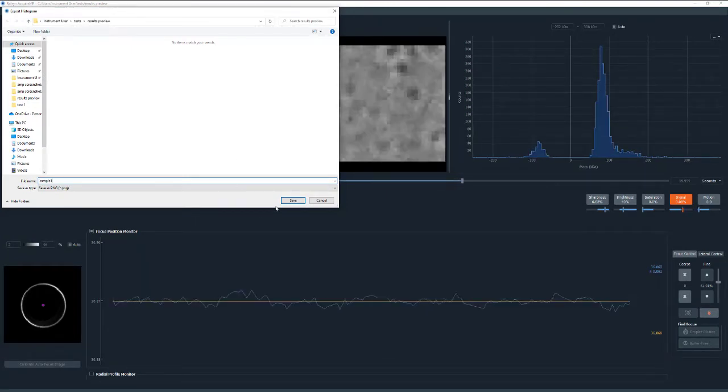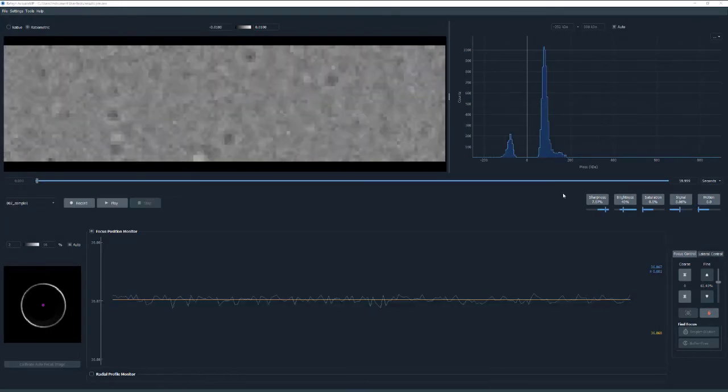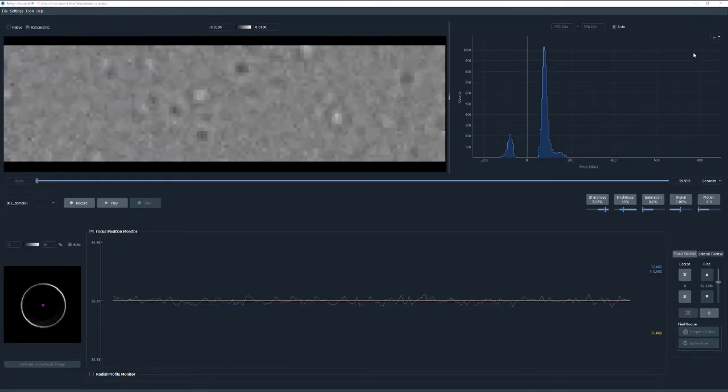The Analysis Preview functionality can be disabled at any time by selecting Disable Analysis Preview available on the menu.